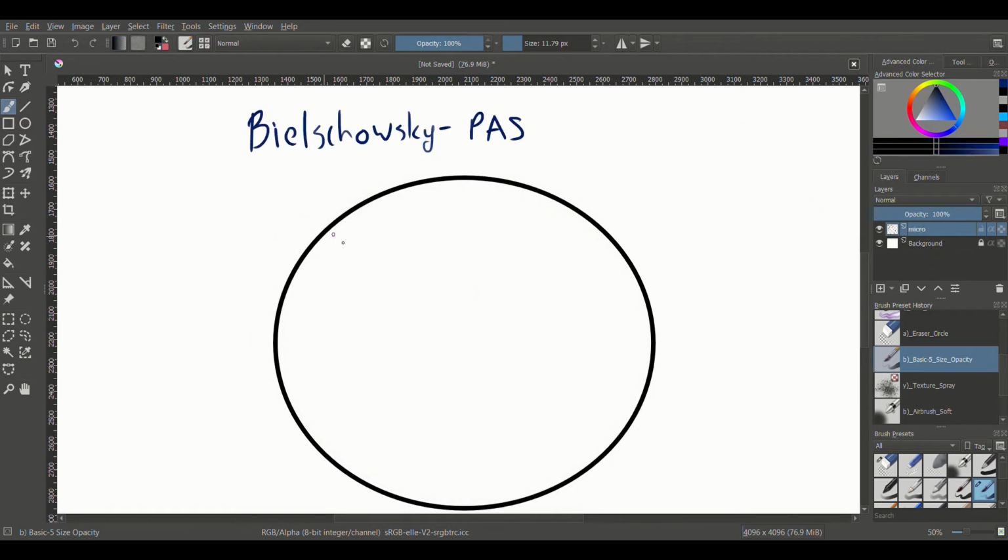Our next stain is the Bielschowsky PAS stain. So the Bielschowsky takes what we learned with the previous stain, our Holmes method, where we use kind of a basic environment to be a bit more selective. We use this one specifically to find neurofibrillary tangles associated with Alzheimer's disease, as well as adding the PAS there to highlight some of the amyloid plaques. So this is kind of a stain used to identify Alzheimer's disease.